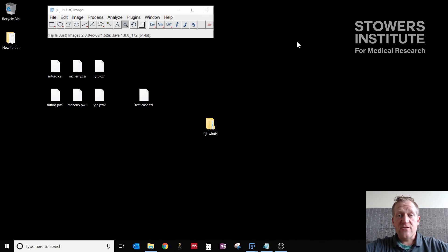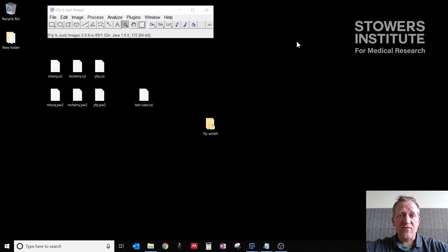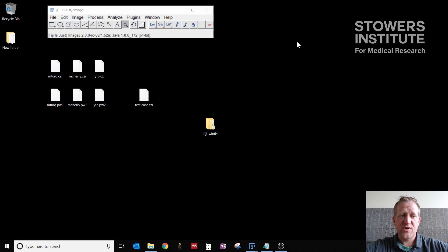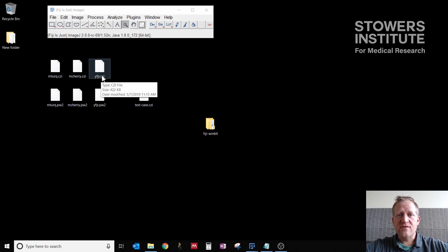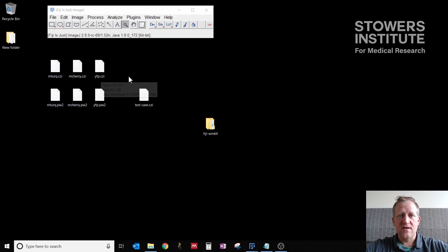So today we're going to cover linear unmixing. This is a process by which you can remove competing fluorophores from your sample. Today we have Pombee cells that express mTurk, mCherry, and YFP. And we want to get rid of those competing fluorophores and separate them into their own channels.